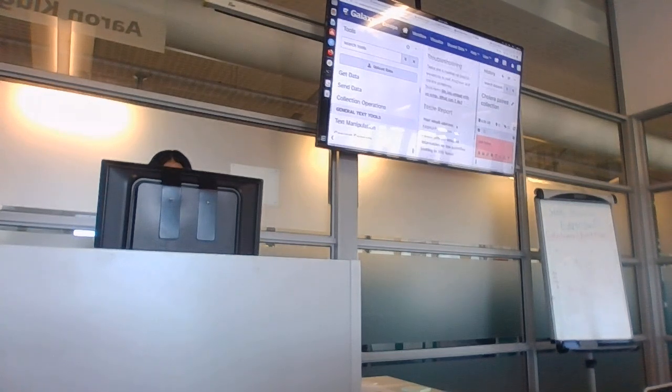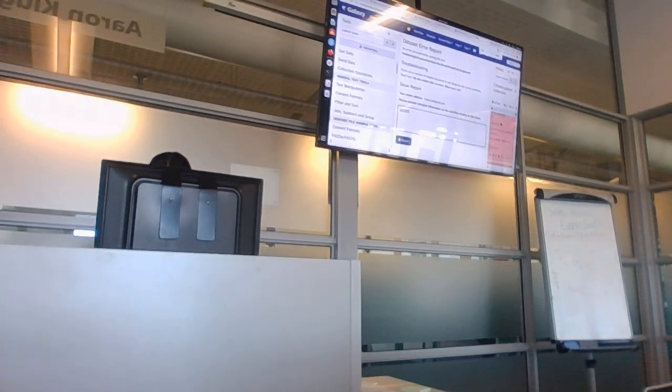It tells you what the problem was, and it also allows you to report. So you can type here as much as you want about what the issue is, what the error message is, and report it, and usually they do answer quite quickly. They will get back to you about what your problem is, an empty file or something like that.